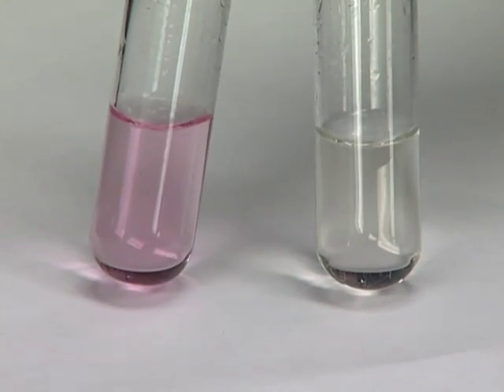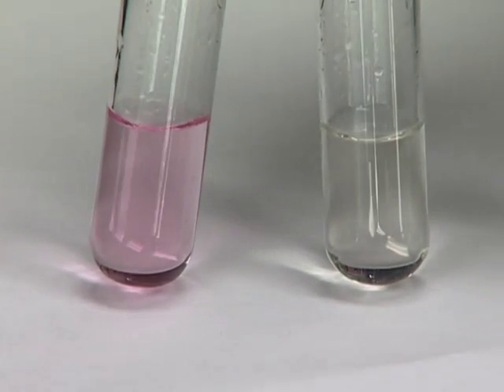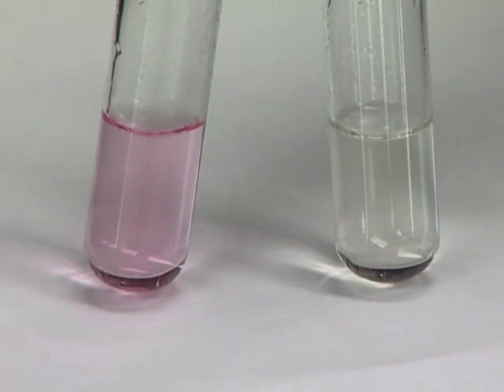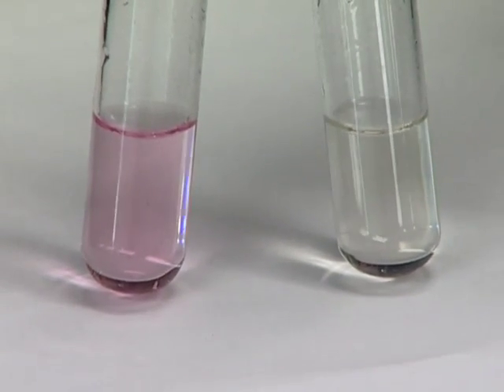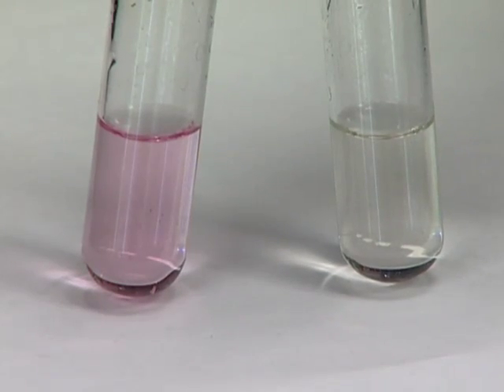Now that you've reduced your media, it should go from blue to pink to clear. After you autoclave them, all of your tubes should be clear. If they're still pink, this means that either you have oxygen contamination or your media is too acidic. Now that your media is made, it's ready to autoclave.